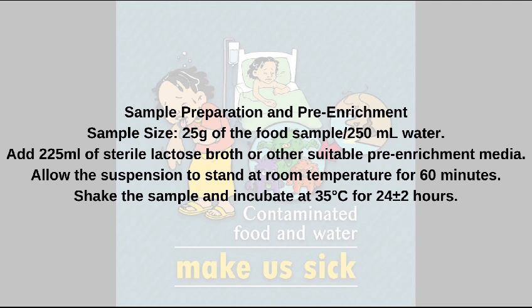If we want to analyze dried active yeast, then we can use trypticase soya broth. If we are analyzing onion or garlic powder, then we can use trypticase soya broth containing potassium sulfite at a final concentration of 0.5%. If we are analyzing Salmonella species in milk chocolate, then it should be reconstituted using non-fat dry milk.